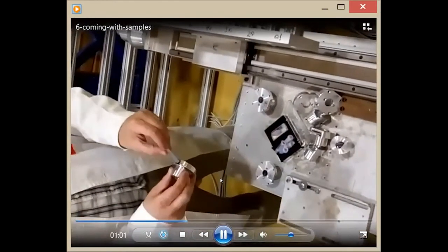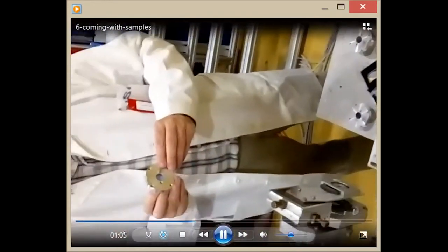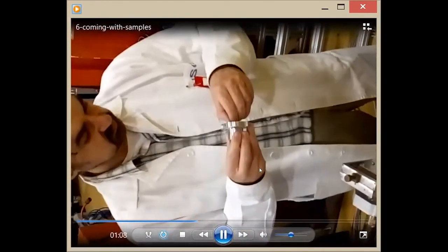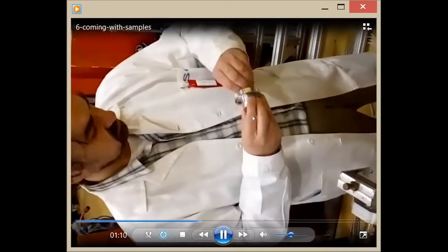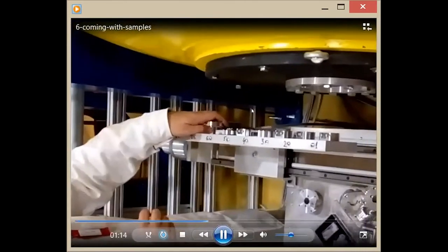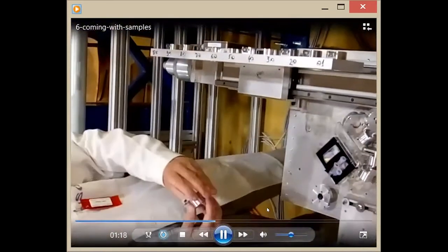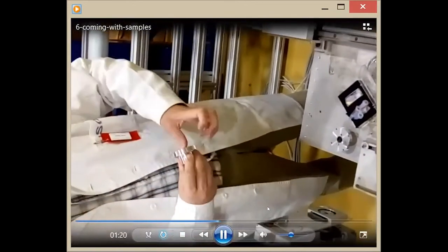So these are the quartz cells. They are made of quartz glass, and they are usually 1 centimeter in width. That's why we need to use such a focusing or beam collimation which fits this size. So 8 or 7 millimeters is the usual beam size for these cells.